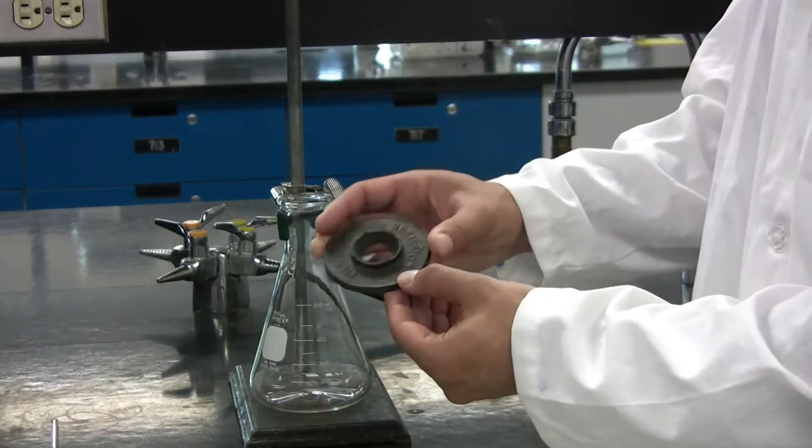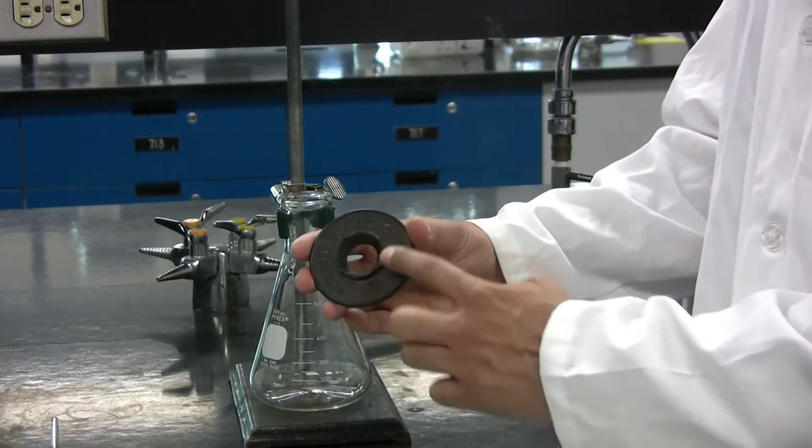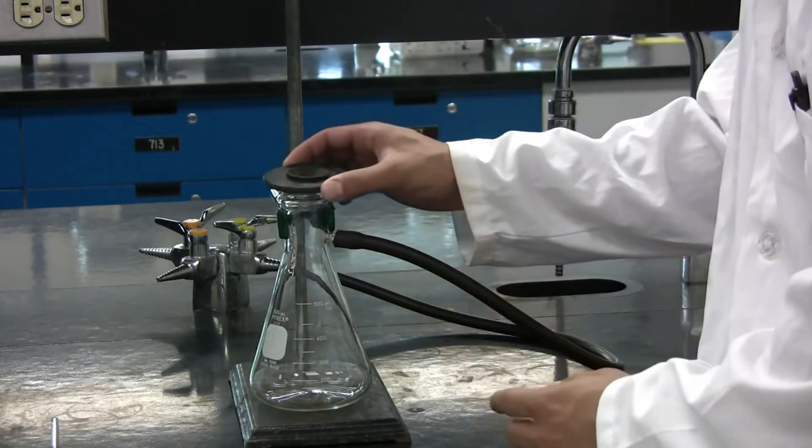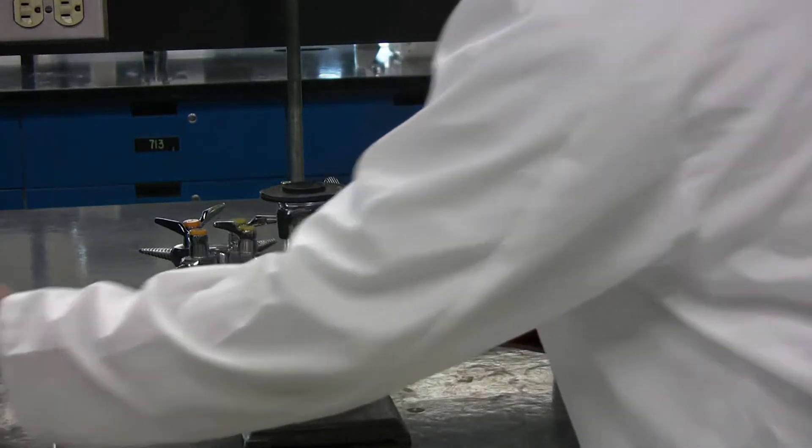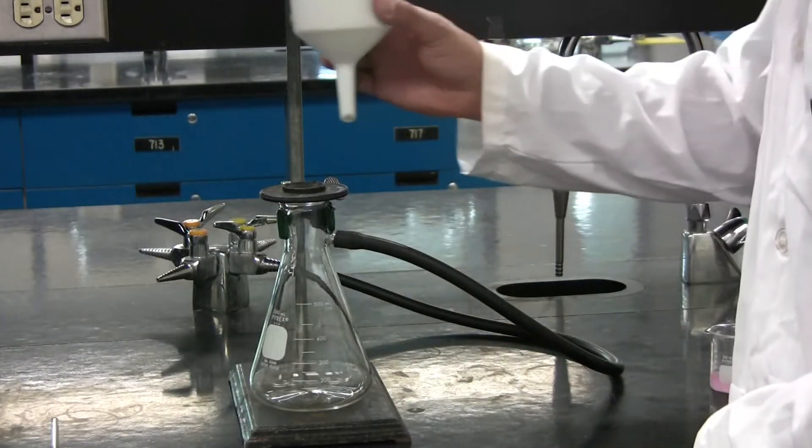Take the rubber seal, writing side up, and place it on the Erlenmeyer flask. Now, place the Buchner funnel on top of this.